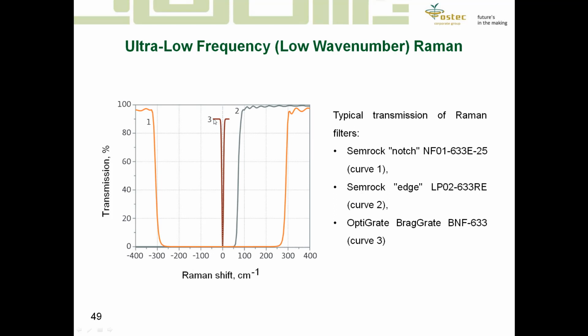You can see a comparison of the Bragg volume filter, which is in the center, brown color, to the normal notch filter.